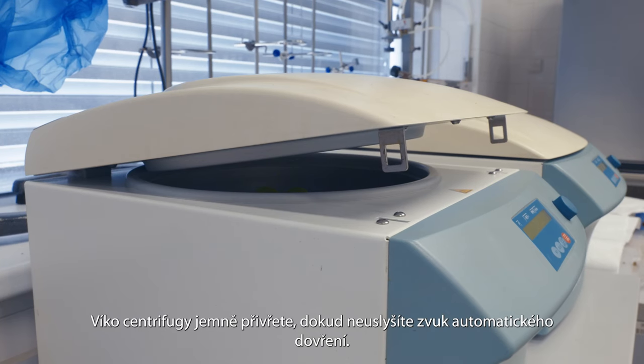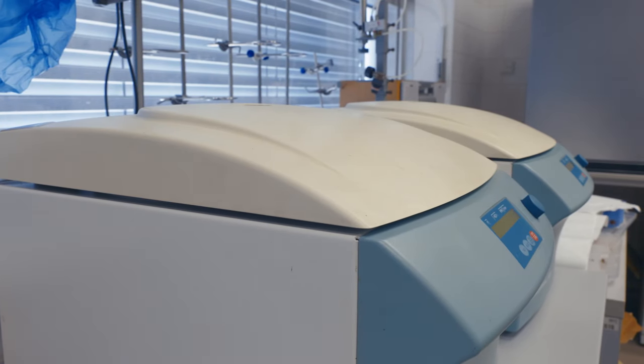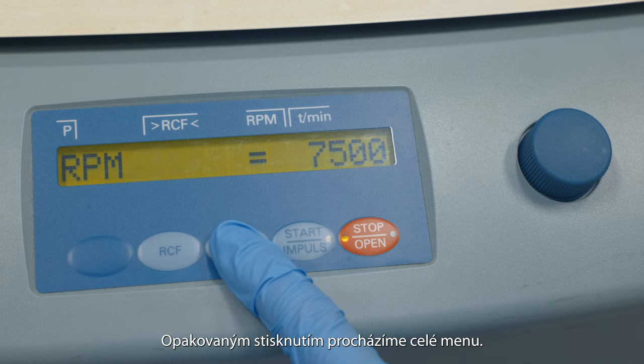Gently close the centrifuge cap until you hear the automatic closing sound. The centrifugation parameters are set by pressing the select button. Press it repeatedly to scroll through the entire menu.